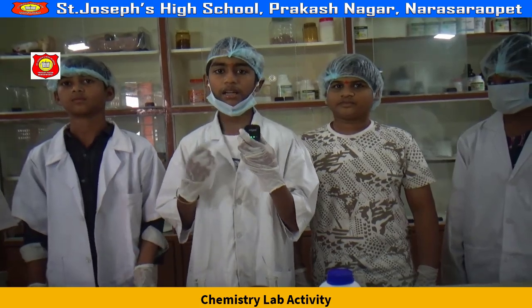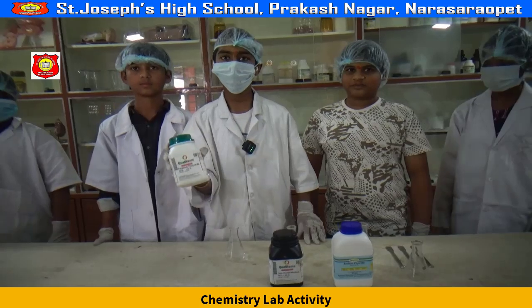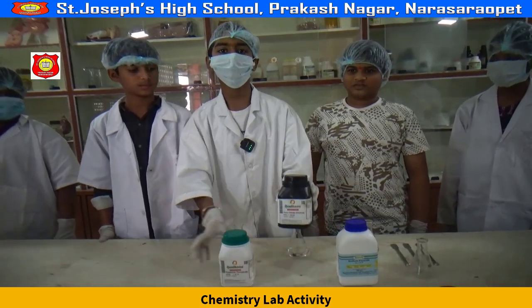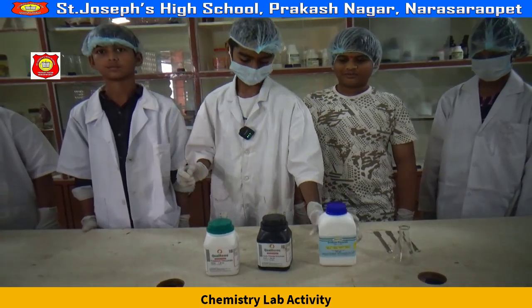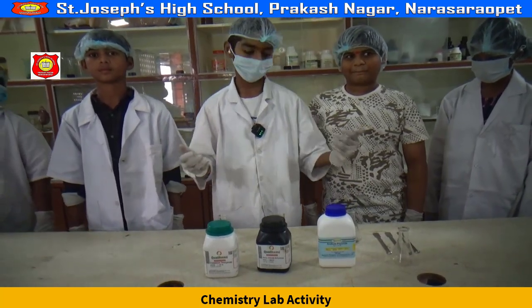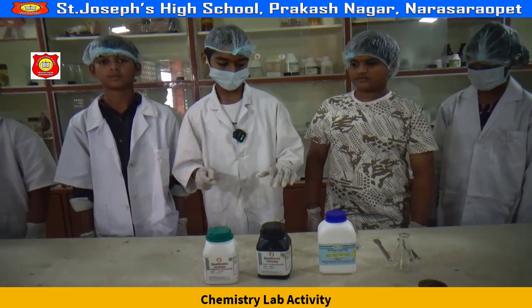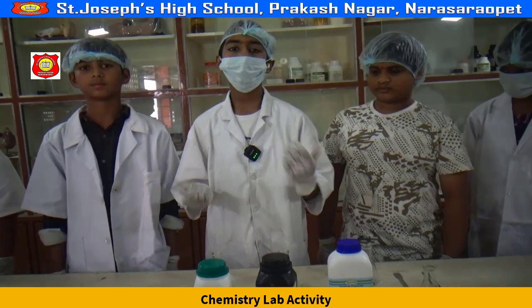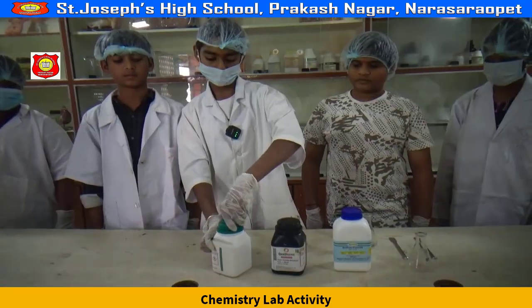Now we are going to do the experiment. This is potassium thiocyanate, this is ferric chloride, and this is sodium fluoride. We are going to make the experiment so-called fake blood. Now we are going to take a spatula. For each we have to take a different spatula, as they may react and form a new solution. So first we are going to take potassium thiocyanate.